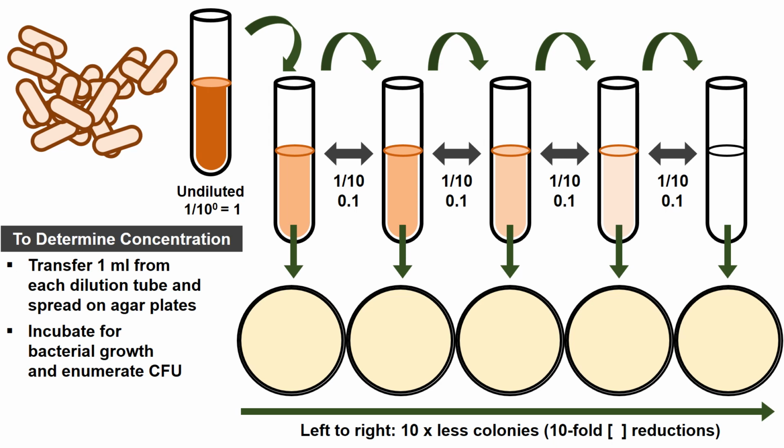It's worth a brief note here that we are working with perfect powers of 10 in assumption that there were no pipetting errors along the way. That's not quite true in practice. Between mechanical and human error in experimentation, it's never going to be quite 10, but you get the picture, okay?